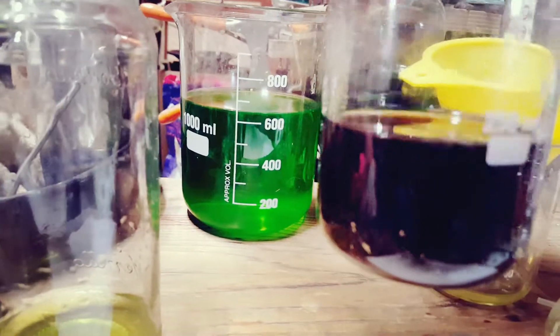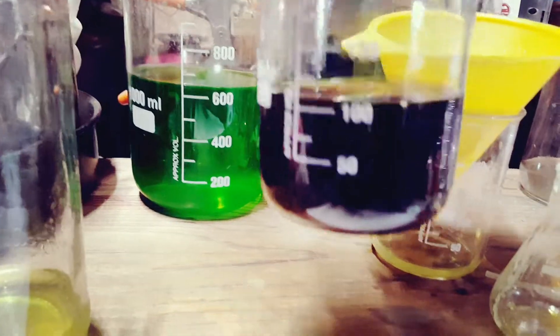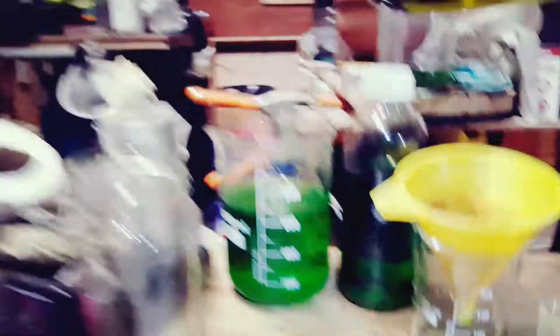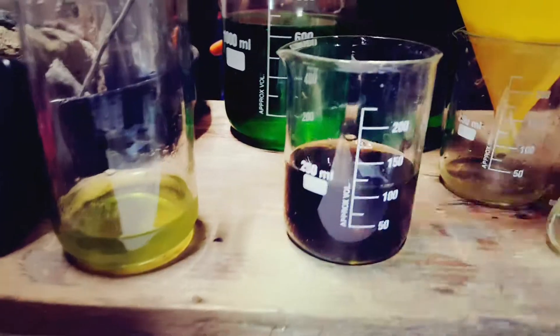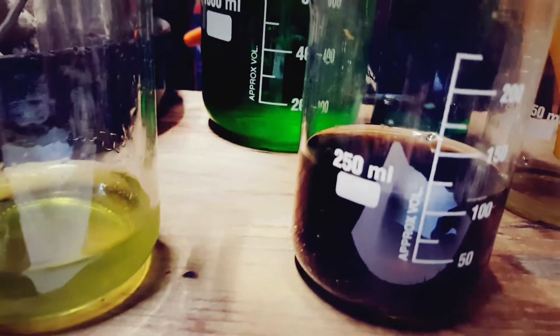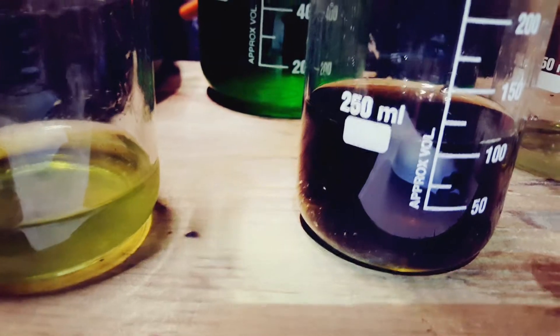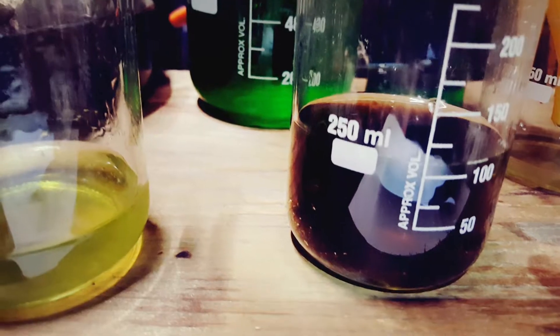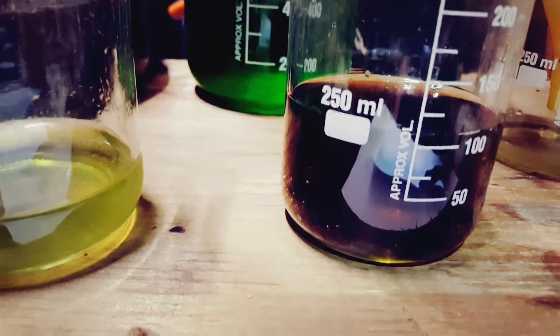Now it will need to settle for about 24 hours and settle to the bottom. Then I will melt it with some fire into a nice little button. There you go, Mary. That's it.